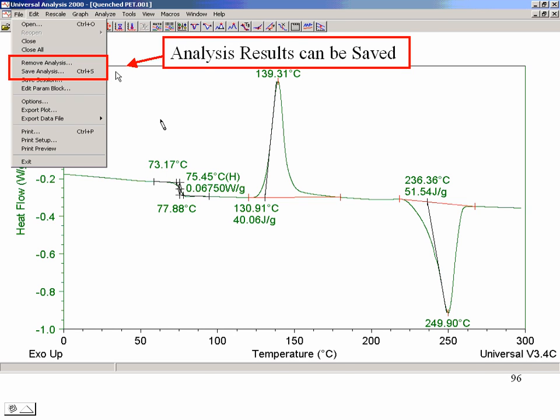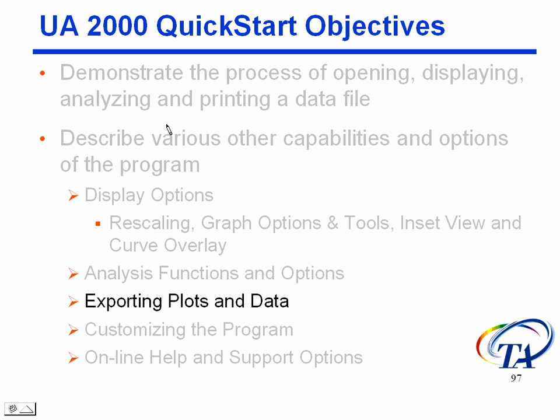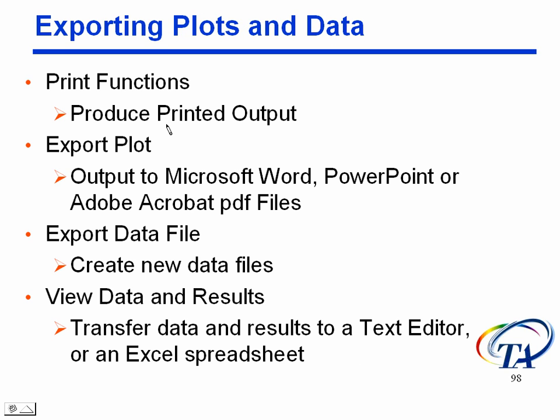All right, now we should get into the business about exporting plots and data now. There's really a whole lot you can do with that, so let's get into that now. Basically, the simplest exporting plot is a print. A print is actually an export, an exported plot.